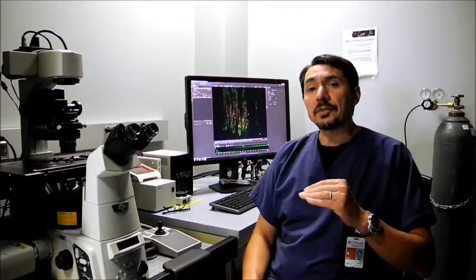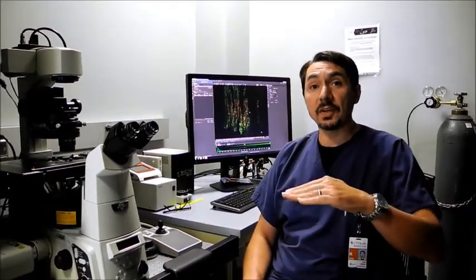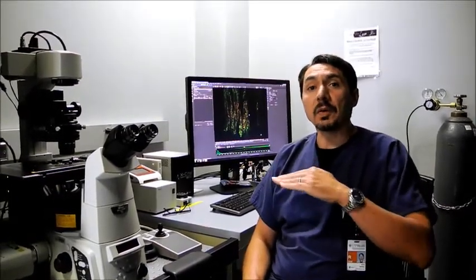The confocal microscope, in a nutshell, is a microscope that allows us to see deeper into a sample than the surface. With a normal microscope, you just see the surface of the sample. With a confocal, you can, like a CT scan, go in depth into a sample and get volume within the sample and look for what you are looking for.